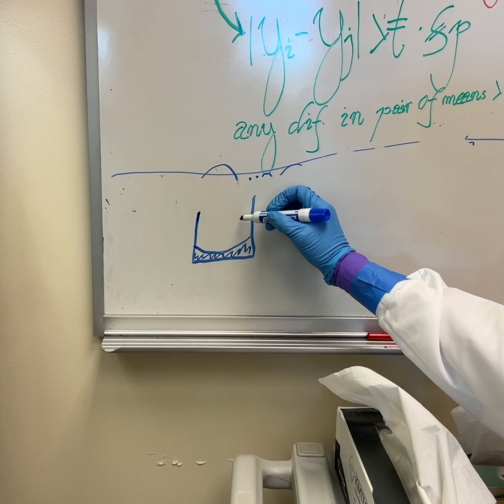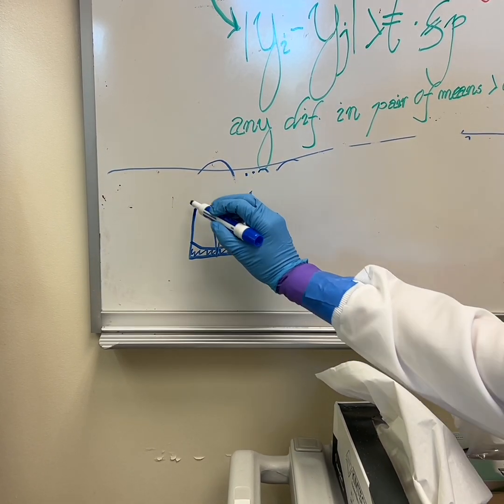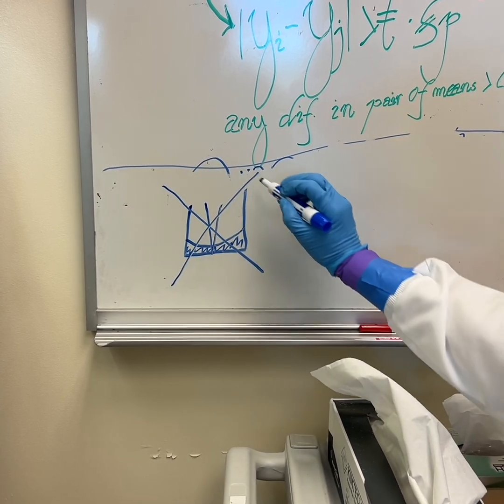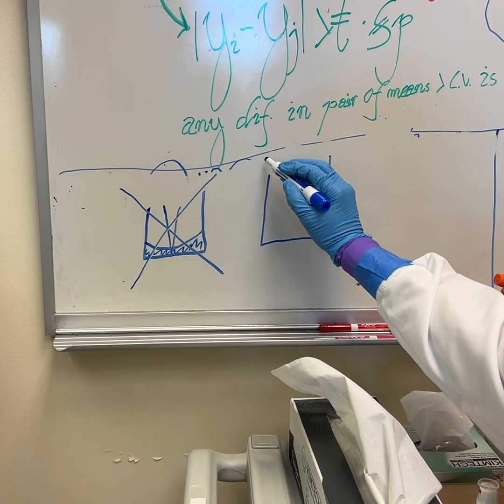Okay, so when you go in with your tip, that's going to disturb the biofilm, right? We don't want that. What you want to do is kind of go in the corner, okay?